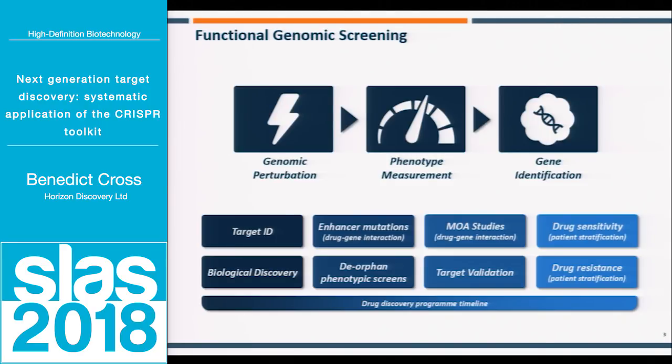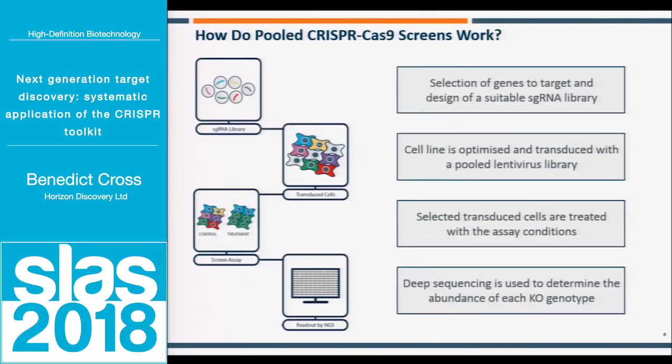And the interesting thing about this kind of approach, and in particular with CRISPR technologies, is the surprisingly broad applicability across drug discovery pipelines, I guess, so that you can start to explore the application of this kind of technology in a very early stage, in really kind of hypothesis-free discovery programs, and all the way right up to almost preclinical analysis. In fact, even beyond that, if you're thinking about bioproduction, which we won't touch on too much today. So I'm going to use as a vehicle for describing how we've been using these technologies, mostly things like mechanism of action analysis with small molecule compounds, but I hope you'll be able to see the sort of broader opportunities that are possible with this kind of approach.